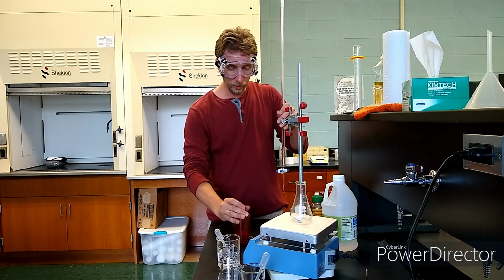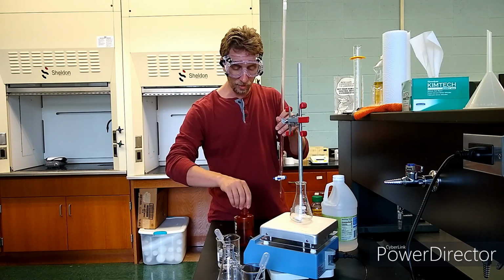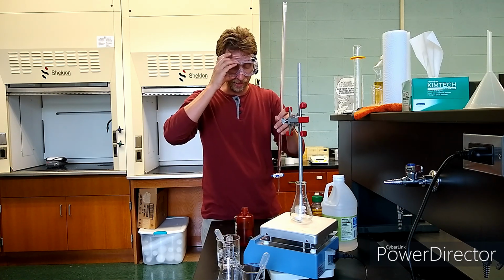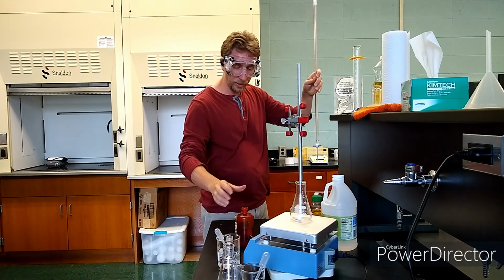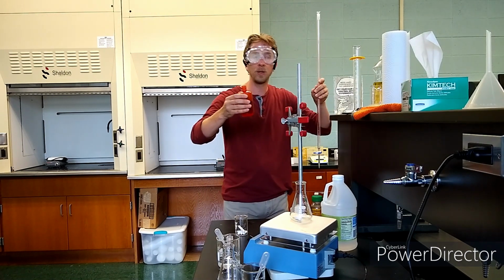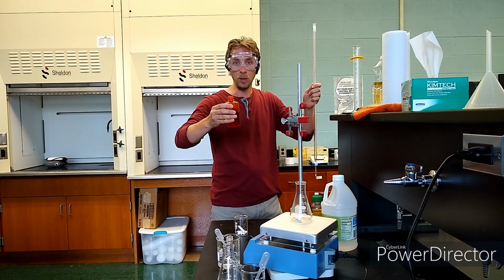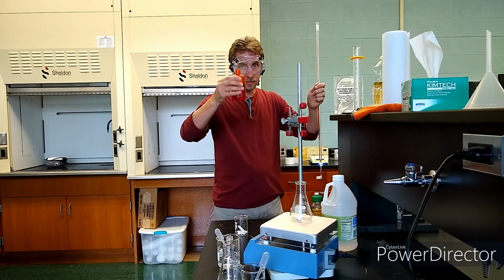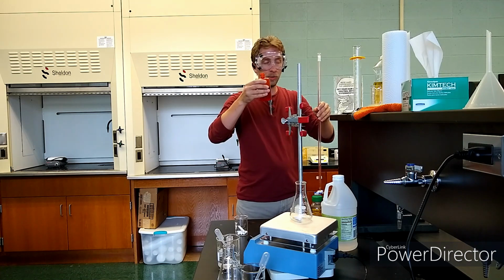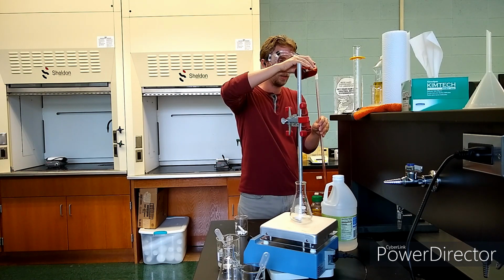But if it got into a slight scratch or something, then it would start to burn very badly, similar to how alcohol burns if you put that on a scratch. Anyway, so I drain that down the drain, and it gives off an odor similar to chlorine. If you go to a public swimming pool, you smell the chlorine in the air. That's similar to how iodine is a little bit more pungent maybe than chlorine. And you don't want that odor building up in the lab. So I like to rinse it down the drain with running water right away.